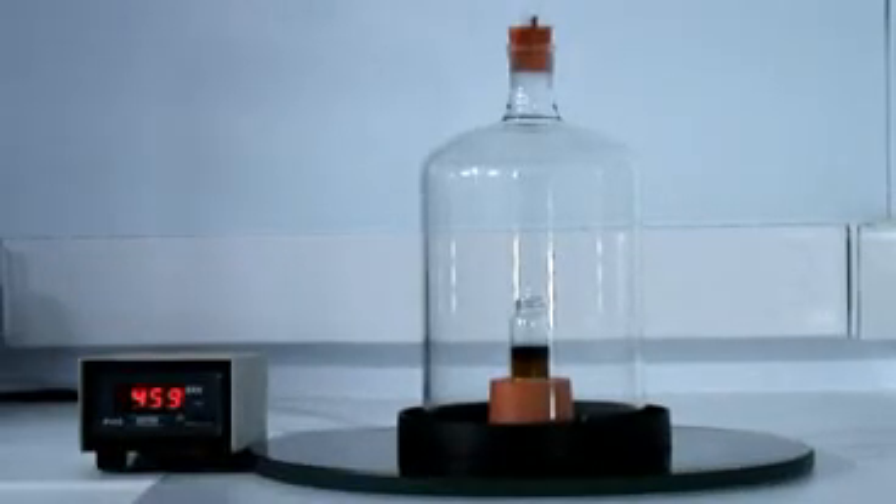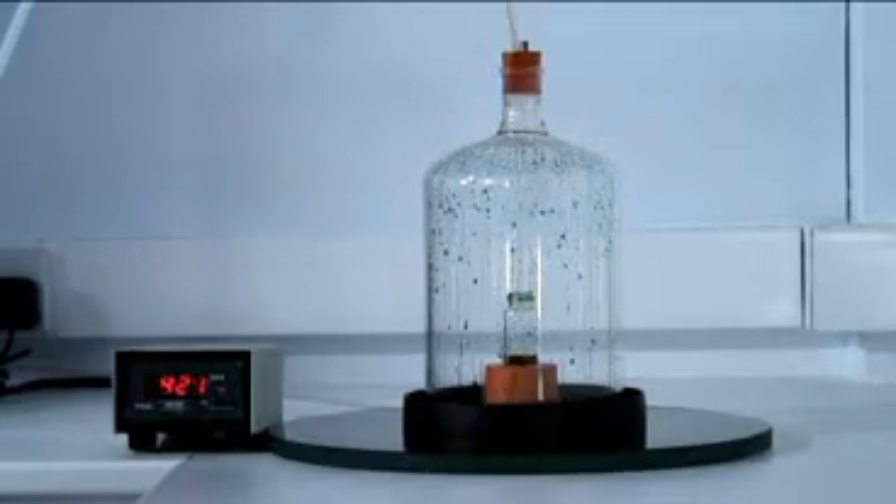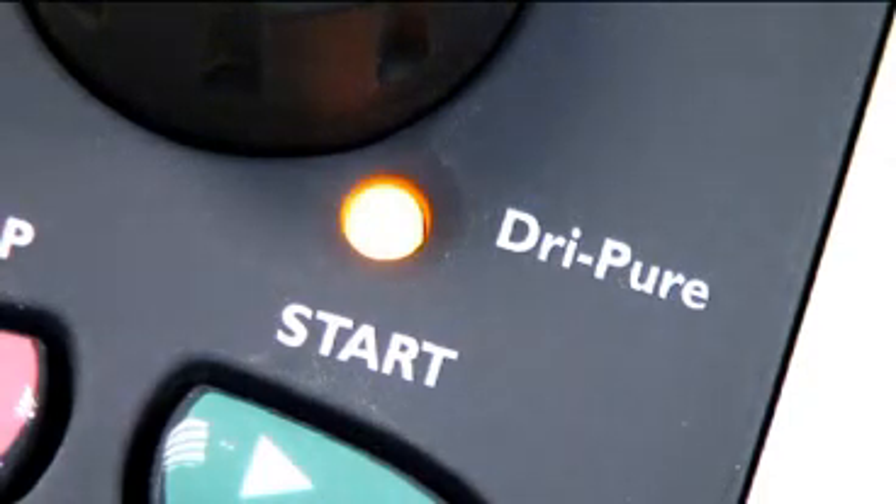Because Genevac's evaporators can handle multiple samples, the effects of boiling over or bumping would be catastrophic. Genovac's Dri-Pure system is used to control bumping and eliminate its effects.